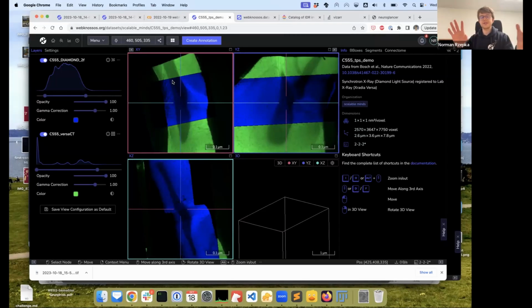Good. As I was saying, that's transformations, we're working on that, and we're happy to get feedback. If that's useful to you, then please let us know what kind of features you would need. All right. Another feature that we recently added, but it's not fully supported yet, is time series support.